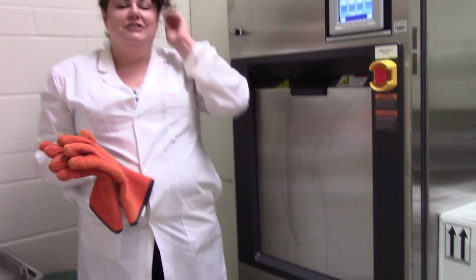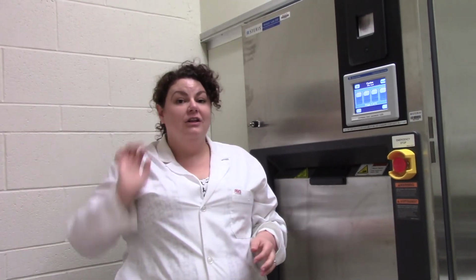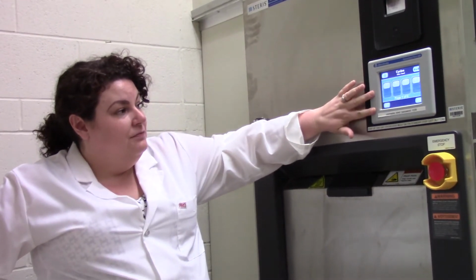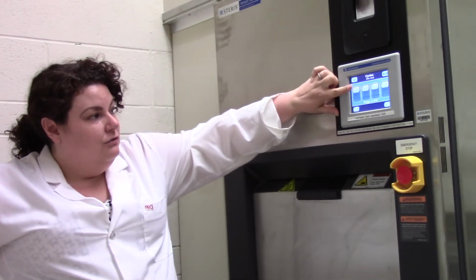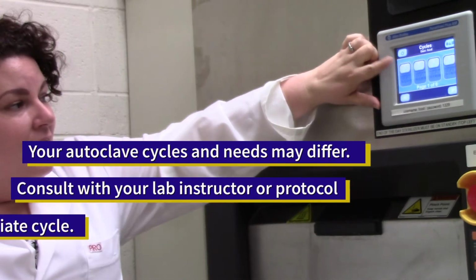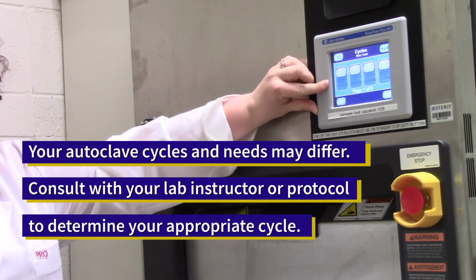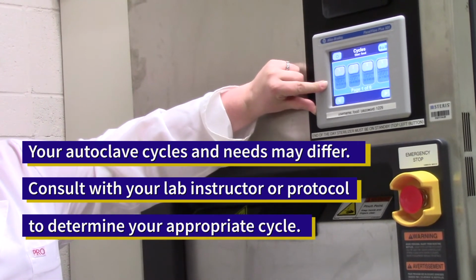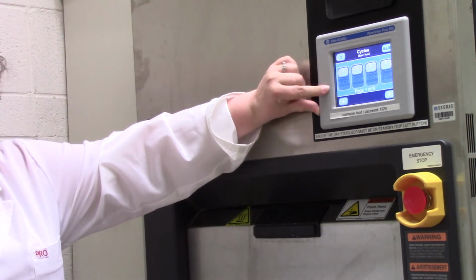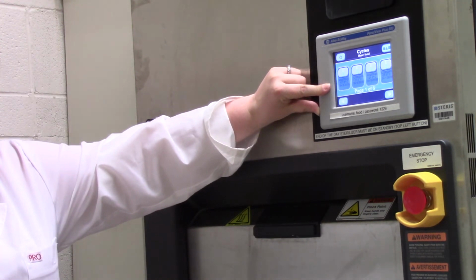Now that my materials are safely loaded in the autoclave, it's just a matter of selecting the correct cycle and starting it. 9 times out of 10, you are just going to use this very first cycle that comes up on the touch screen. It says liquid 20, that means it's a 20-minute cycle. It also says 121 degrees Celsius, which is the temperature that it will run. And then it just, again, indicates that it is a 20-minute cycle.